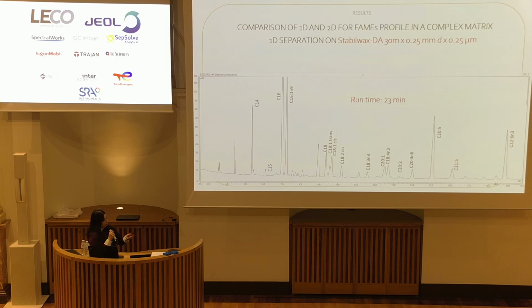You can reduce a lot the running time, but what happened? All the analytes are not well separated, and a lot of coelution occurs. For example, here, of 40 detected peaks, only 18 were identified.